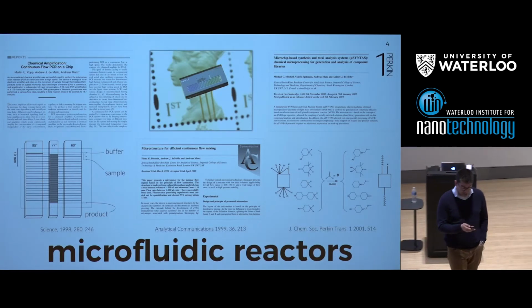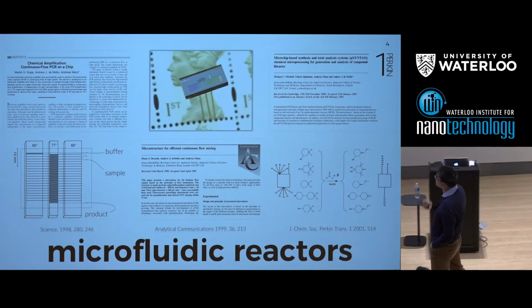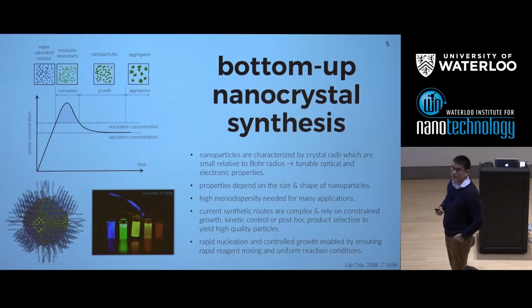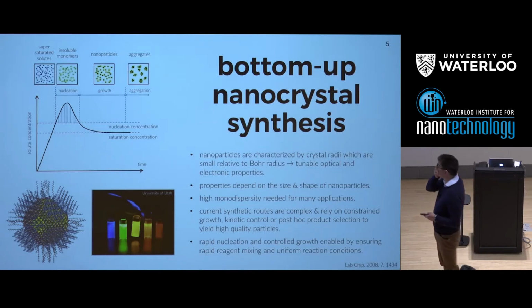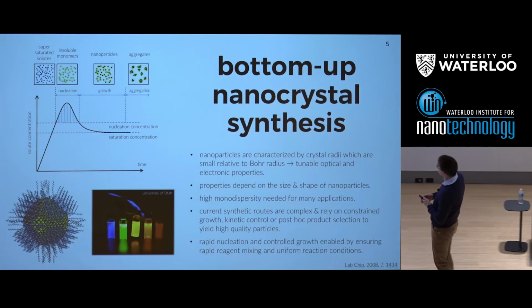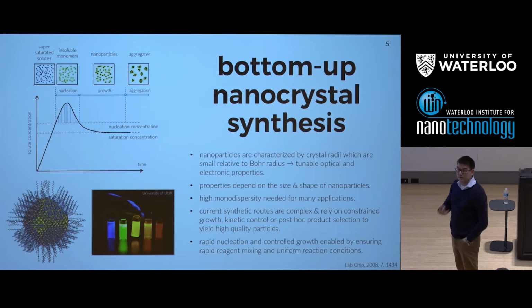But after a few years addressing various aspects of small molecule chemistry, we became more interested in seeing if we could use microfluidics to start to control nanomaterial synthesis. So this here is a very short summary of work that we introduced back in 2001, but with a very, very simple idea.